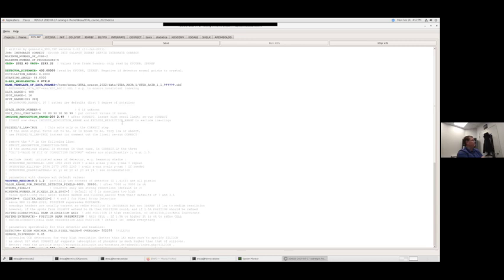So similar to when we did the snapshots where we looked at 0 and 90, we can do something similar here where we give it smaller ranges, but we give them more than one spot range. And that can give you as good of an indexing result as you would get from doing a whole half data set, but using significantly less computing power, because now you're only looking at 20 images instead of 300 images for that spot picking step, that colspot step.